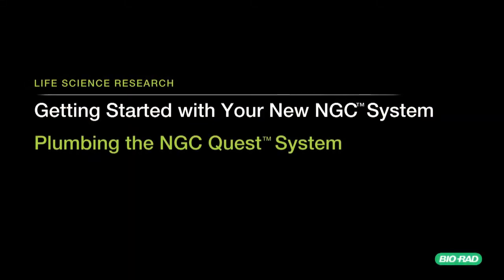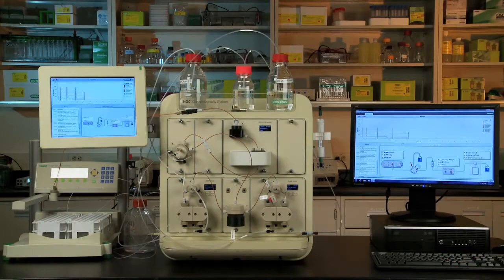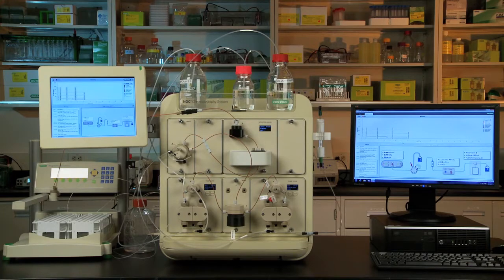This video shows how to install plumbing on a new NGC Quest 10 or Quest 100 system. When installing plumbing, tighten all fittings into their ports.